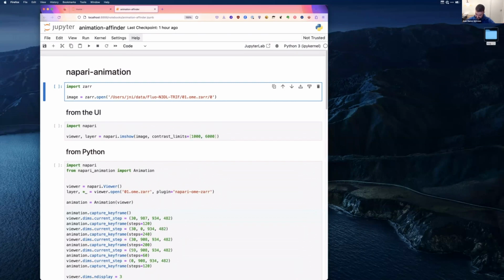So it was started by Napari Movie, which was like a little standalone package by Guillaume Witz. And then Nick Sofronieff and Alistair Bird have been really leading the development since then. But actually, it's quite a quiet repo. Like the design is good enough that there's not much stuff happening with it, which is really cool. So I'll do a couple of demos and then I'll talk a little bit about how it works.